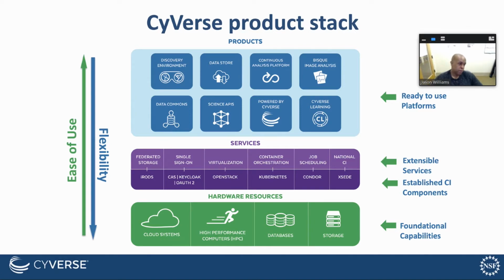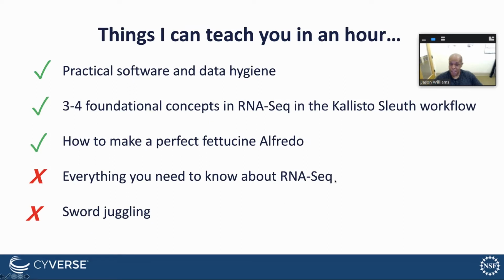But also for people who are more on the end of developing their own pipelines, you can actually access some of the services and foundational capabilities, everything from containers and container orchestration to working with federated storage and so forth. So there are really a lot of capabilities depending on what your level of skill is. I'm assuming the majority of the audience will be, in this case, microbiologists, but for those who do have a little bit of a developer toolkit or interested in applying it in more customized ways, those are things that you can do.